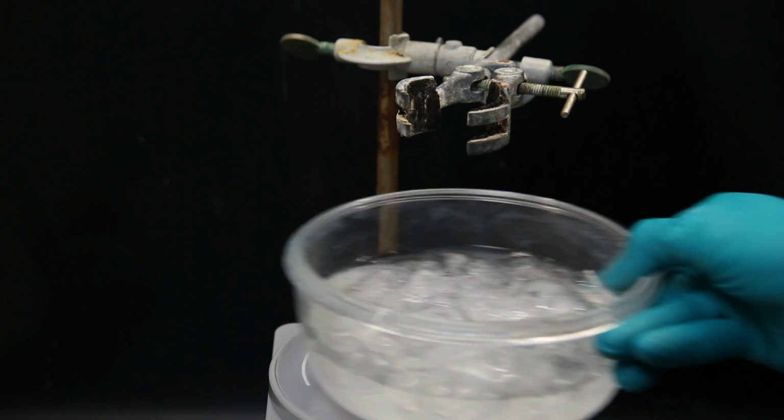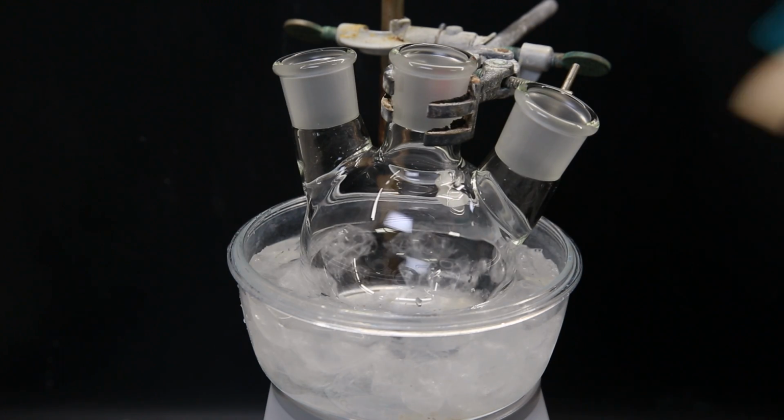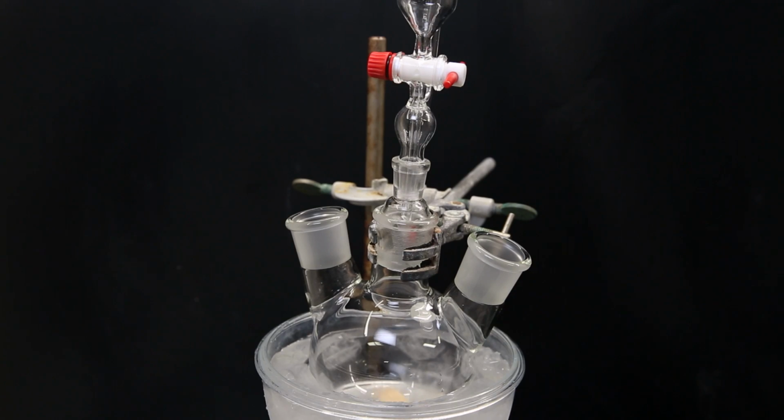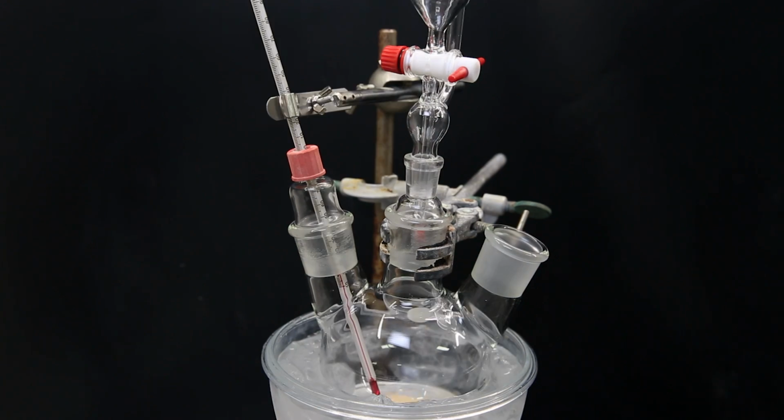To get started, I set up a stir plate and put an ice bath on top. I put in a 500 ml 3-neck flask with a large stir bar. Then to the middle neck, I have attached an adapter with a small dropping funnel. To the left neck, I attach a thermometer adapter to keep an eye on the internal temperature. This reaction should be kept between 4 and 8 degrees Celsius to prevent side products from forming.